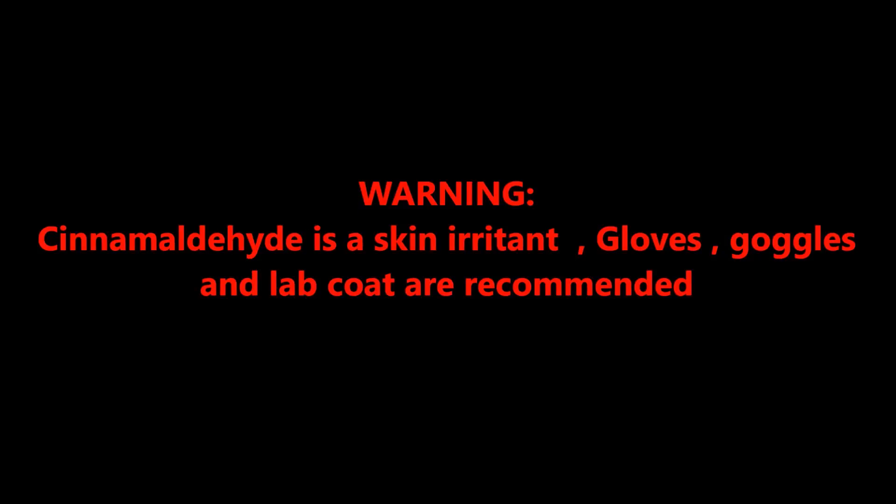Warning! Cinnamaldehyde is a skin irritant. Gloves, goggles, and lab coat are recommended.